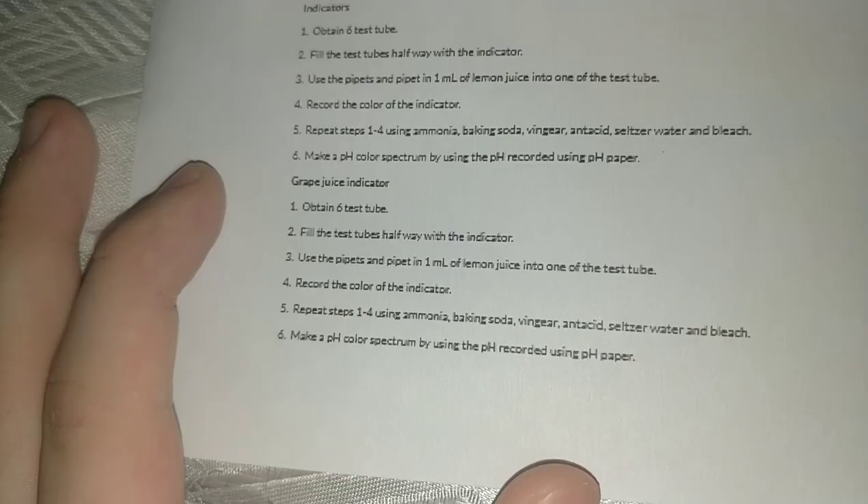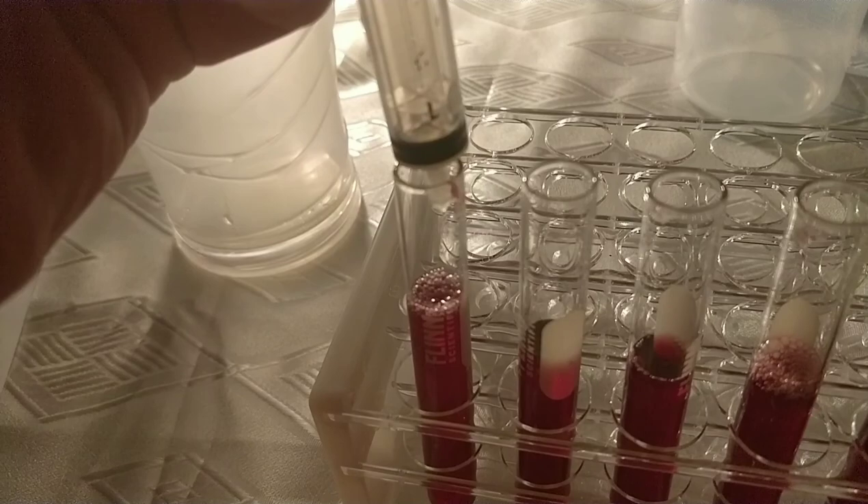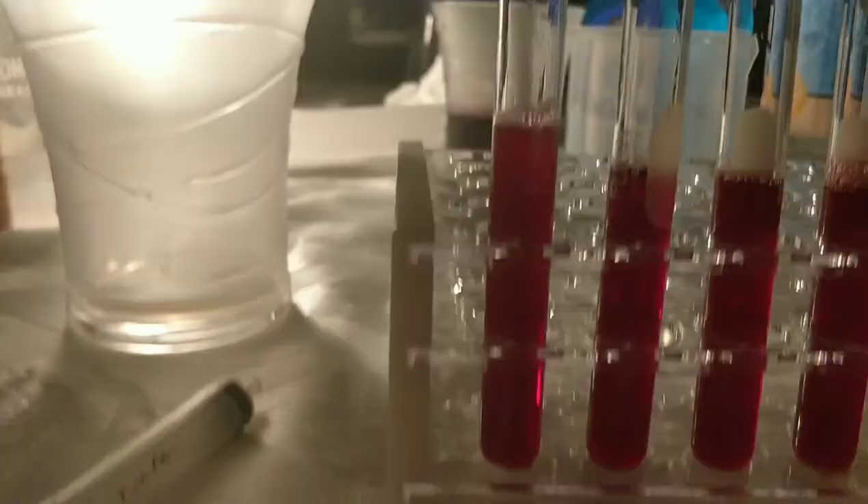Now we'll move on to the final indicator — the grape juice. Here I have the six test tubes with grape juice in them. I'll start with the lemon juice — one milliliter added to the grape juice. Comparing it to the grape juice next to it, I'd say it stayed about the same color, maybe gotten a tad bit lighter.